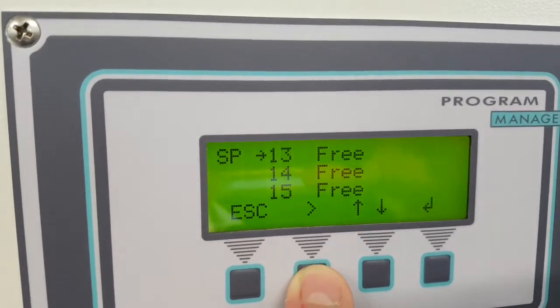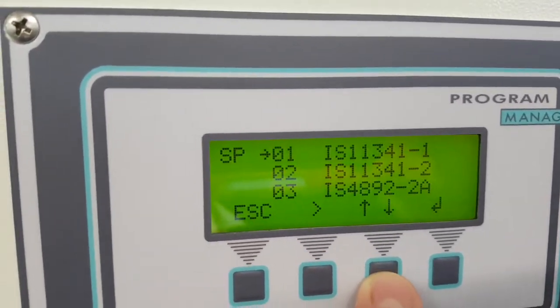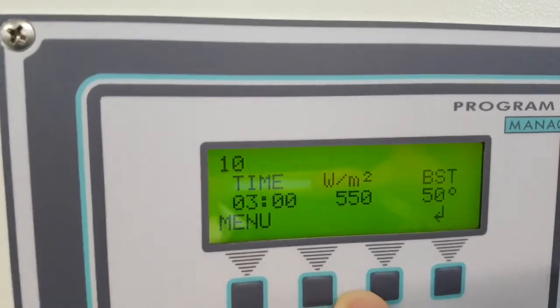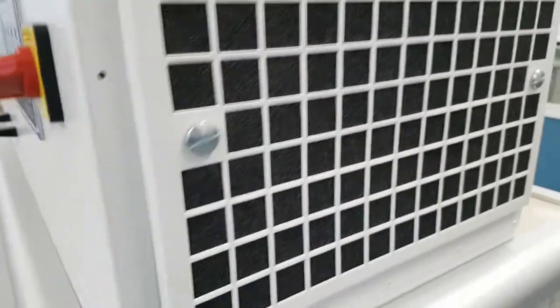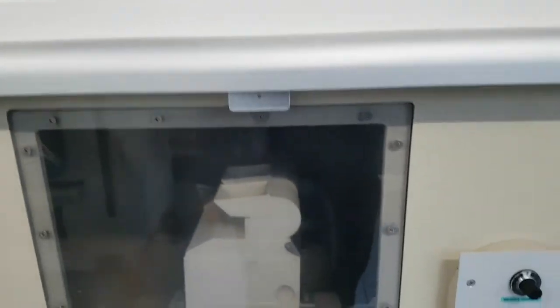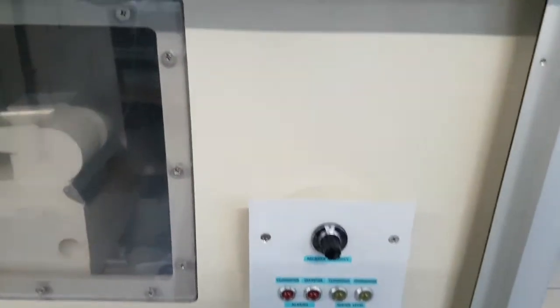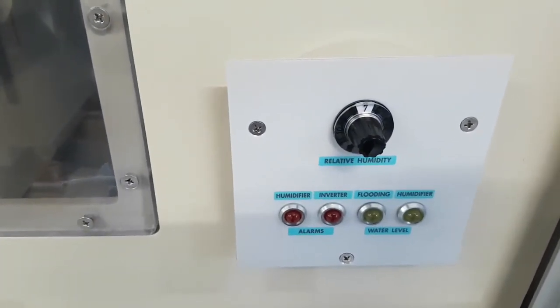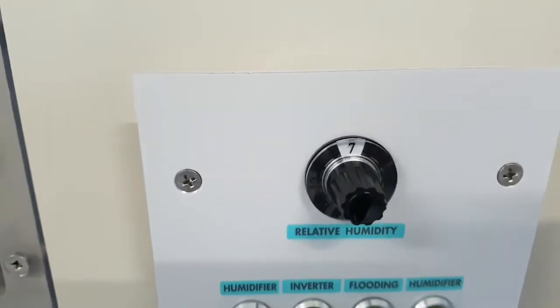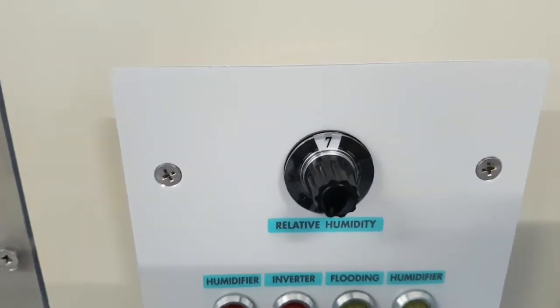You have three other tests available. On the top, you have the lamp — the Xenon lamp. And here you have the filter. Here you select the amount of humidity that you need. For example, in this case 7 means 70%.